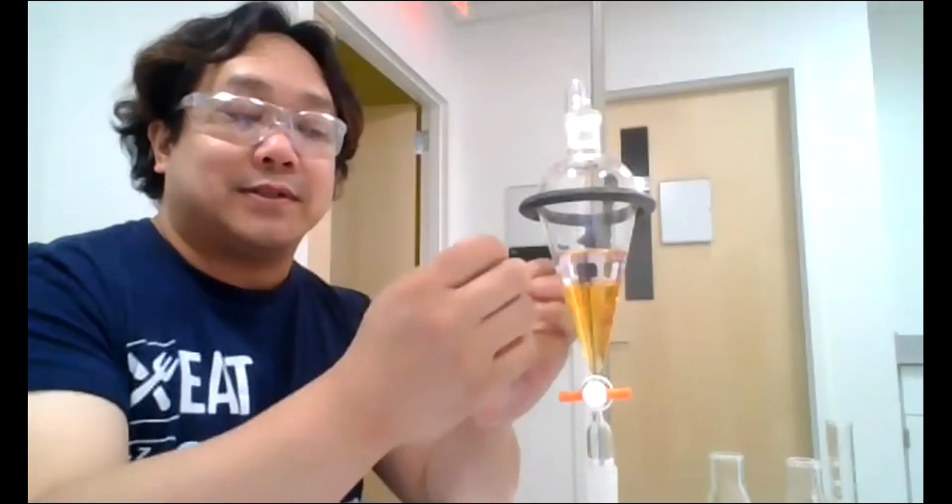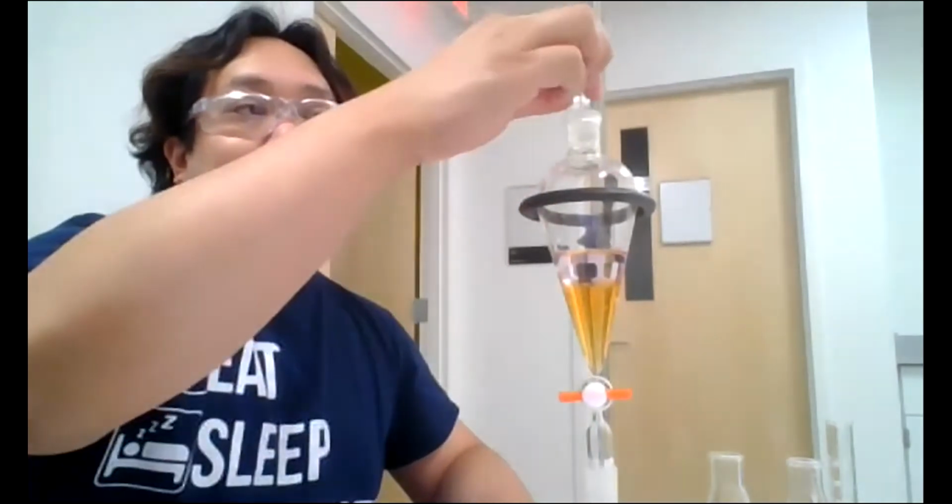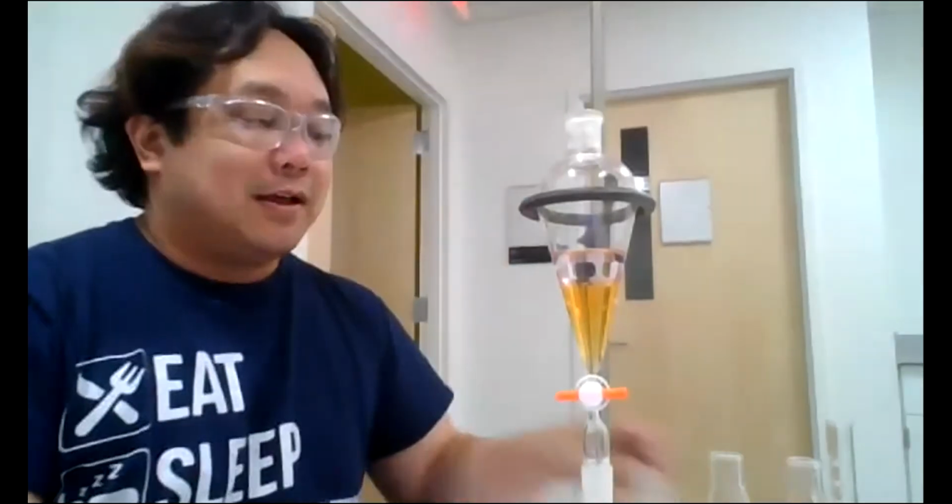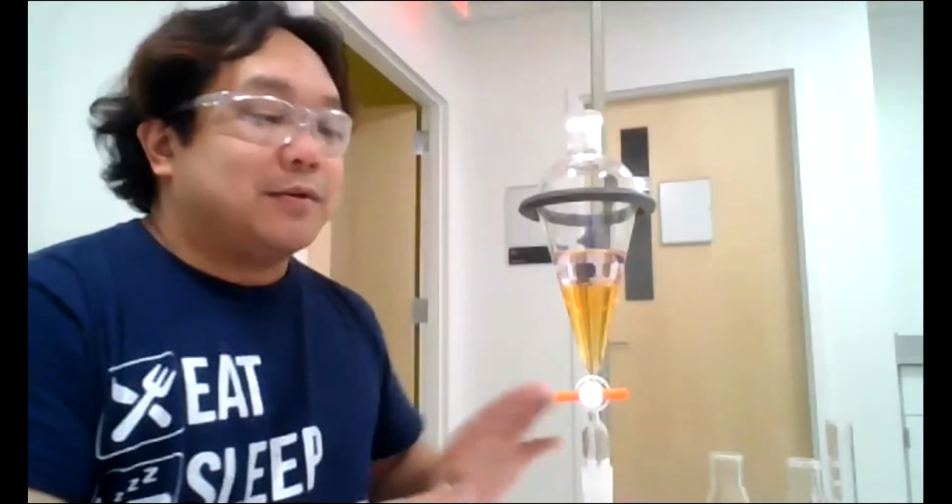The best way for that pressure to be released, if there's too much of it, is to explode the glass outward, or, like a rocket ship, eject this stopper upward. I've seen extractions where the pressure created enough force to blow the stopper and impale it in the ceiling. So you just want to be careful.